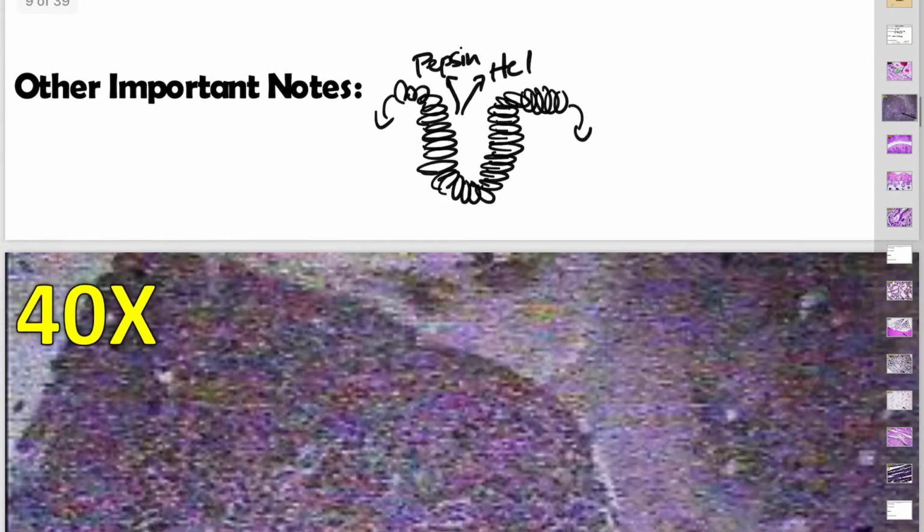Let's go to our third tissue here. Now this one doesn't look anything like the other things we just looked at. If you take a look at this epithelial tissue, you do not see a squamous shaped cell or a columnar shaped cell or a cuboidal shaped cell. You don't really see a whole lot of anything. It looks gritty, kind of like a colored styrofoam. I don't know, it just looks really bad. This is how you're going to tell this one apart from the other ones.